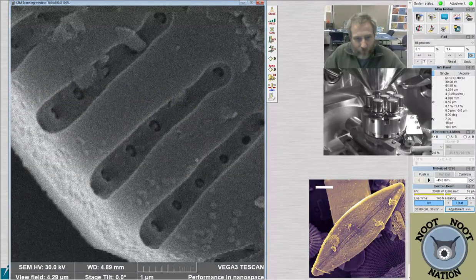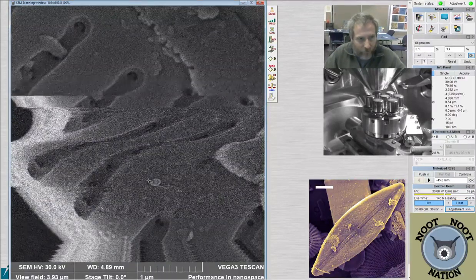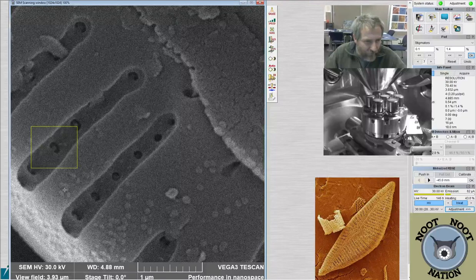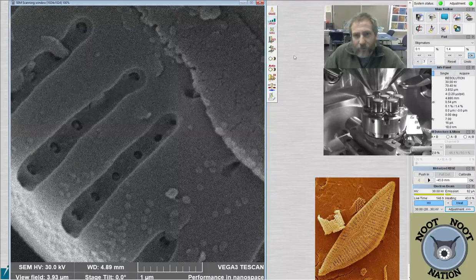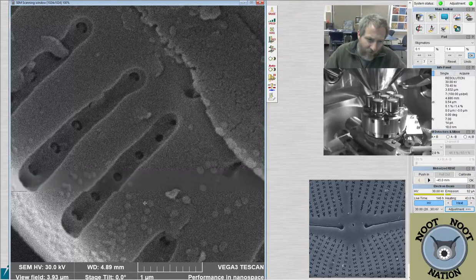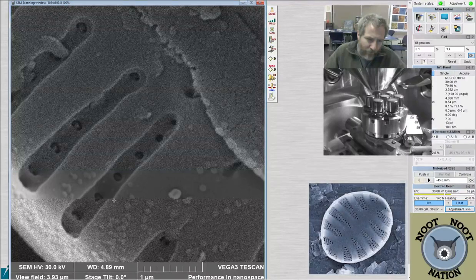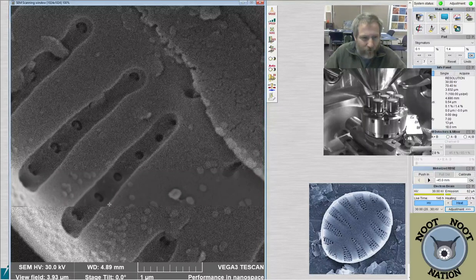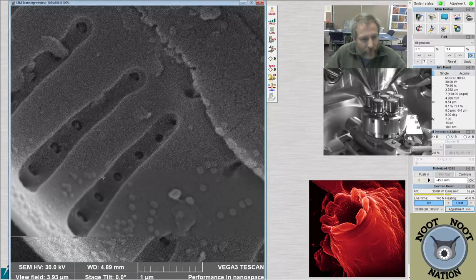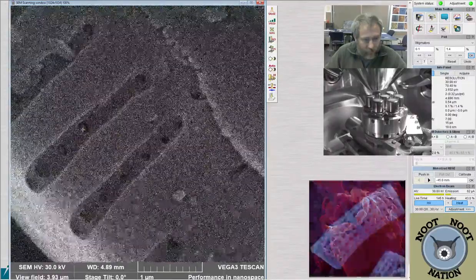And that is really kind of cool-looking pore covers. They look like pacifier-shaped or something in there. They're really interesting. Let's see what we can do about making those look good. You can see there's a little bit of an offset in the image, and that's been happening the whole time. I think it's because the heating element's not perfectly set up correctly on the SEM, so it's migrating just a little, a couple of microns, maybe half of a micron or something, each time it goes around. So there's a slight distortion.